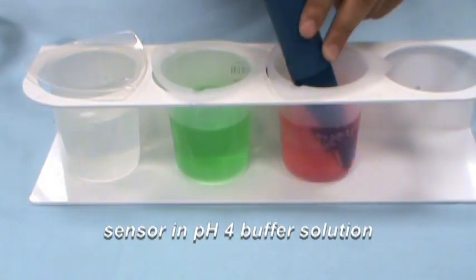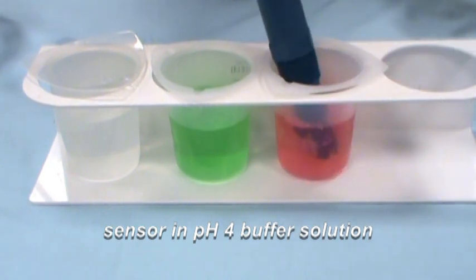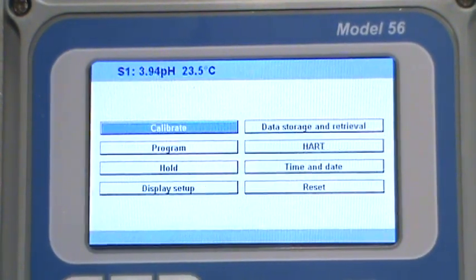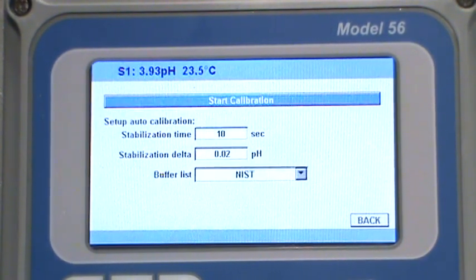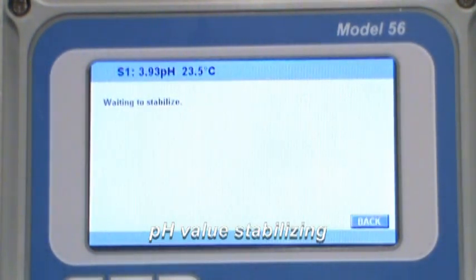A soft cloth or tissue to dry the sensor. Place the sensor in the first buffer solution. In this example, pH 4 buffer solution is being used. Wait for the value on the pH instrument to stabilize. If the sensor is not cooled to the same temperature as the buffer solutions, the stabilization time may take longer than expected, or the calibration may not be successful.